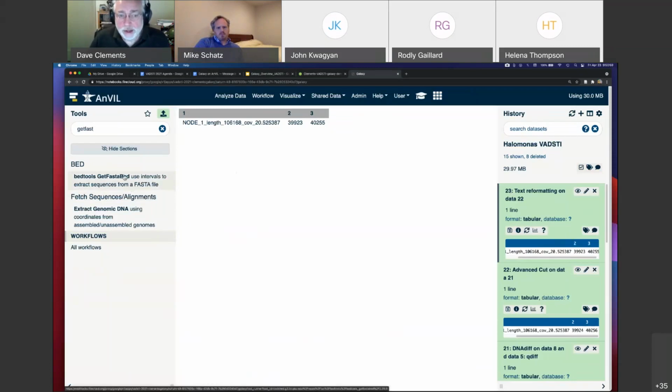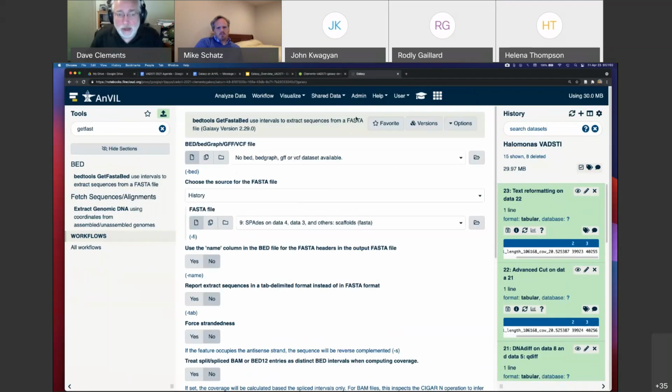So cool. I click on that and I go here and I'm excited. And it says, Dave, you don't have a bed file. And I go, well, crap, I do have a bed file right here. Well, yeah, okay, it is a bed file, but we're not telling Galaxy that yet. We need to now tell Galaxy this is bed. And the way we do that is we change it from tabular, which it is, to say, well, it's tabular, but it's also bed. It's a more specific type.